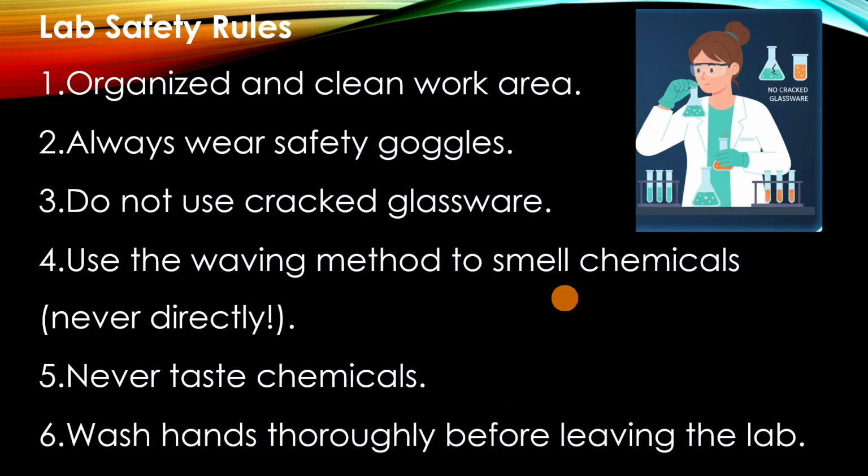You just wave a small bit of air from the chemical to your nose so that you can smell. Then, never taste chemicals. No matter how enticing they look, never taste, because some chemicals are very poisonous.